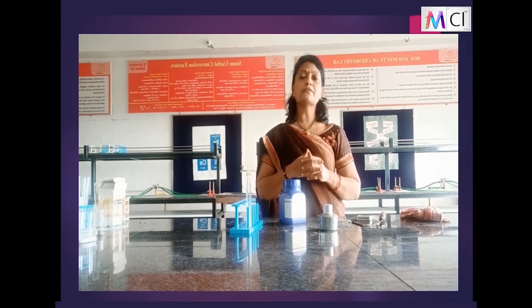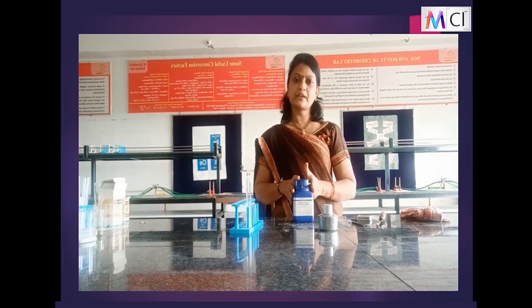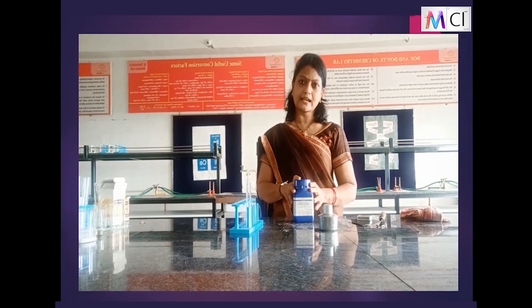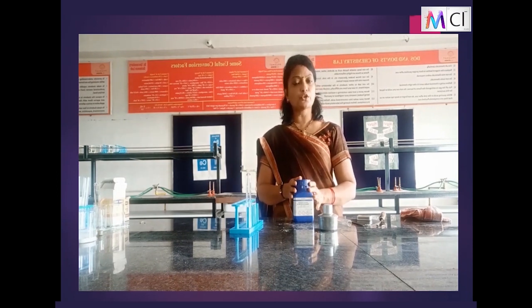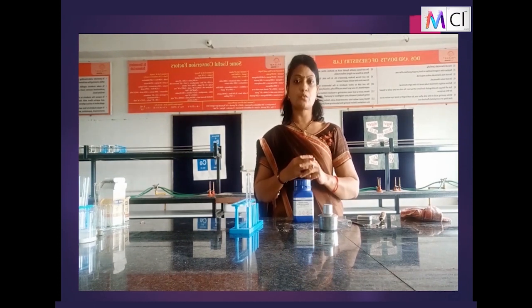Okay, so here we have taken an example of thermal decomposition for you. I have the sample ferrous sulfate. What is the formula for ferrous sulfate? FeSO4.7H2O. What is the 7H2O, children? Water of crystallization, isn't it? This 7H2O is the fixed number of water molecules present in a unit of salt, termed water of crystallization. So ferrous sulfate has 7 water molecules.